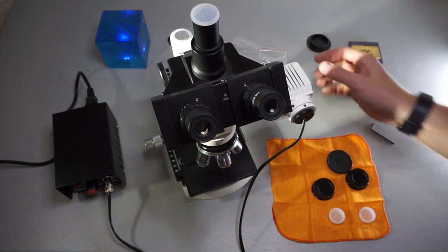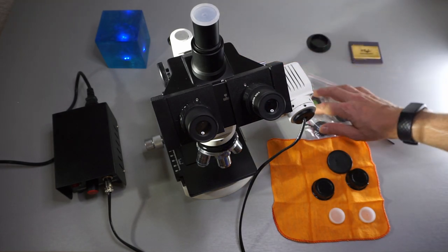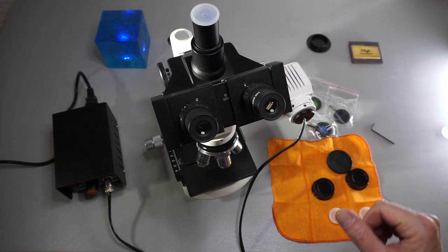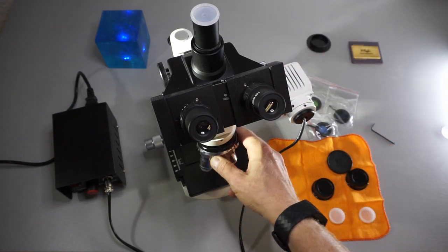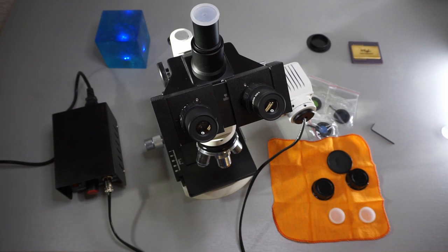Light test accomplished. You have a couple of filters you can insert them at the side. I would say we are ready to go and see if we can get a picture.